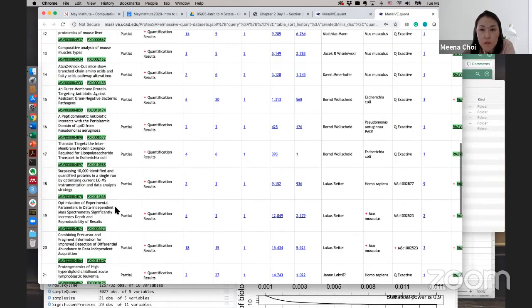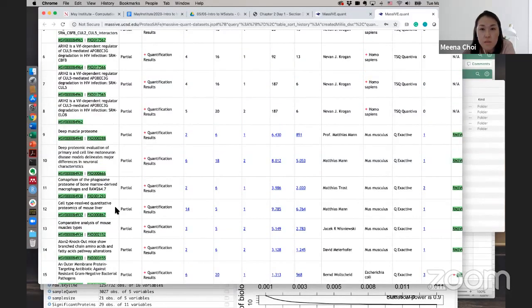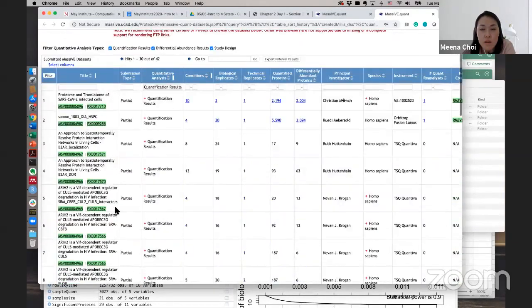We have one data set processed across DIA-Umpire, Skyline, SpectroNaut, open source, all the quant data sets and the R script there. I will also make a link in our Google Doc. If you use one of the tools and then want to use the example R script, you can also use that script.